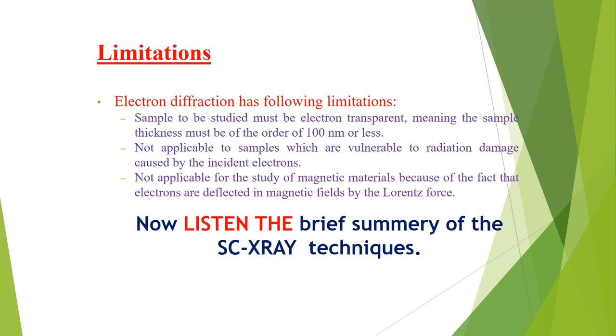A single crystal X-ray diffraction pattern can be divided into the geometry of the pattern and the intensities of the diffracted beams. The geometry of the pattern includes the lattice parameters and the crystal orientation, and it reflects the translational periodicity of the lattice structure. The intensities of the diffracted beams include displacement parameters, site occupancy factor, atom types, and positions. The connection between the lattice and the diffraction pattern is a reciprocal one. A crystal with a more compact lattice results in a wide diffraction pattern, while a large lattice structure gives a compact diffraction pattern.